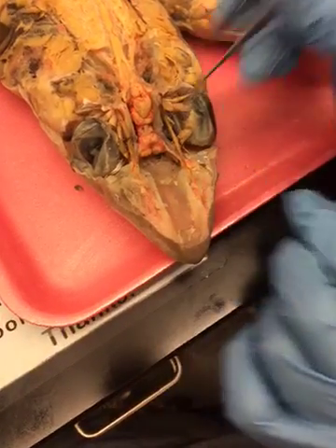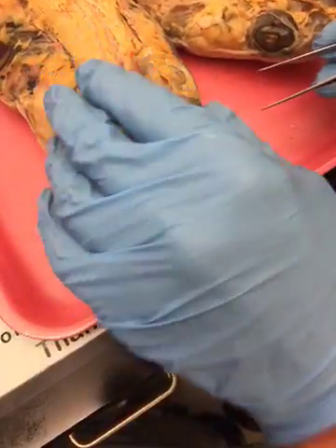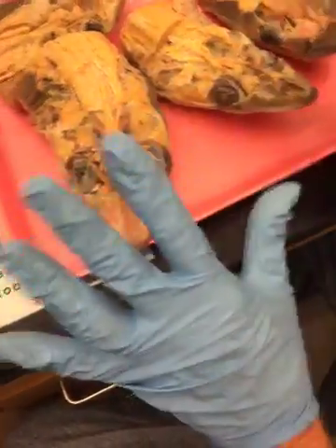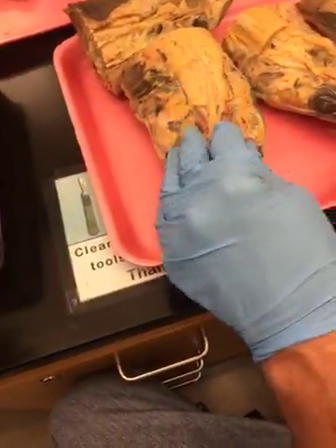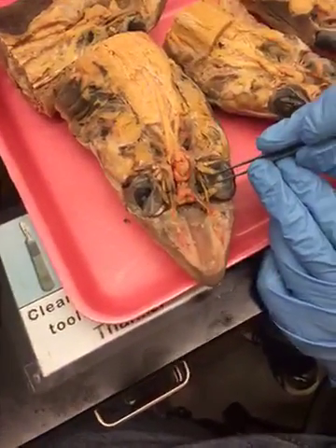So if you just remember that the deep ophthalmic branch of 5 is on the medial surface of the eyeball, whereas the ocular motor over here is way down on the ventral surface, you'll keep them separate. Okay? If I flip the eyeball over, it's the ocular motor. If I haven't flipped it over, it's the deep ophthalmic branch of 5.